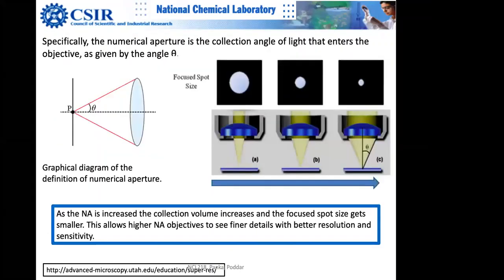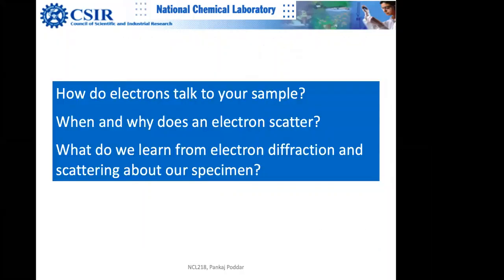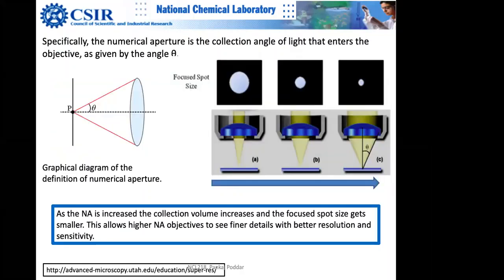So all of you know that you can keep on increasing theta. I just mentioned your mobile phone, and you can see that when you increase theta, you're reducing the focal size. You use this in Raman microscope also, in many places. This is the same science as in your mobile phone, or wherever you have aperture or lenses, or your DSLR. So that science you already know, and it also obviously allows more and more light.